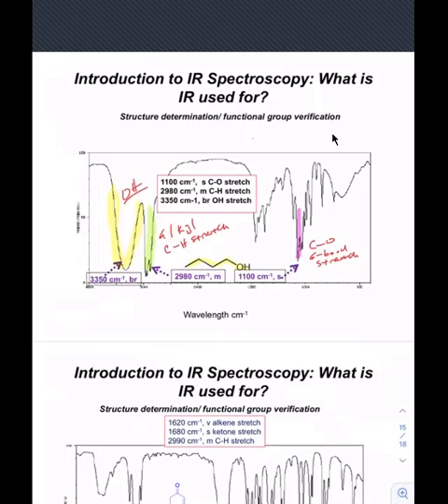The technology for infrared has gotten so much better, because it used to be that you had to dissolve your sample, put it on a salt plate, and put it into an instrument. Now with the FTIR, you can take solids and just put them on a disc, and then there's a diamond tip that goes down where your radiation is coming from onto the sample, and you can take it in open air. That wasn't the case years ago, but now they have much more sensitive and much more accurate instrumentation.